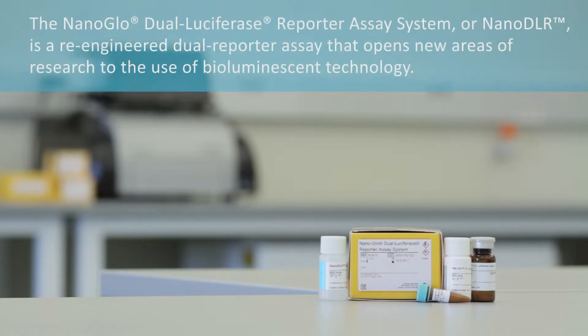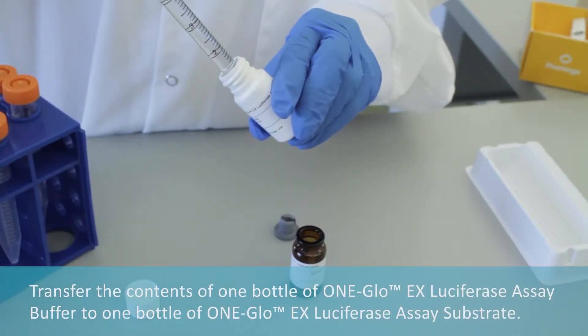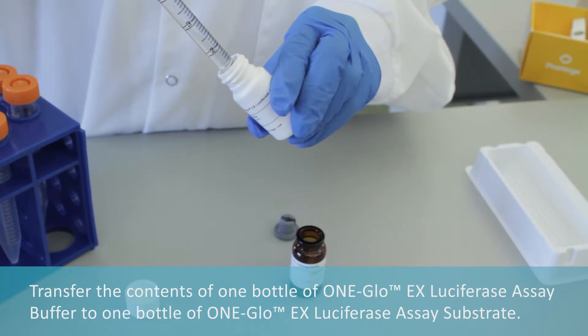The Nano-Glo Dual Luciferase Reporter assay system, or Nano DLR, is a re-engineered dual reporter assay that opens new areas of research to the use of bioluminescent technology. To prepare the reagents, transfer the contents of one bottle of One-Glo EX luciferase assay buffer to one bottle of One-Glo EX luciferase assay substrate.